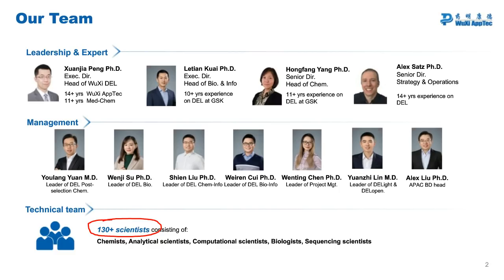What is the molecular weight range of a hit, and can you control it, say up to 300 Daltons? The molecular weight range can vary quite a bit. It's often target dependent. Some binding pockets require compounds which are fairly large, and others require compounds which are small for binding. However, you, as the person who runs the screen and looks at the data, always get to choose which structures you're going to follow up. So if you're working on a target or target class where you need certain physical properties, then you're going to only choose to follow up hits which match the profile that you want.